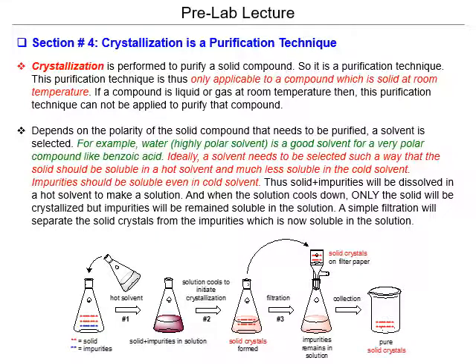However, you have to factor in temperature. A solvent needs to be selected in such a way that the solid should be soluble in a hot solvent and much less soluble in the cold solvent. This is another reason why you have to memorize the boiling points of many of your solvents. Impurities should be soluble even in the cold solvent.